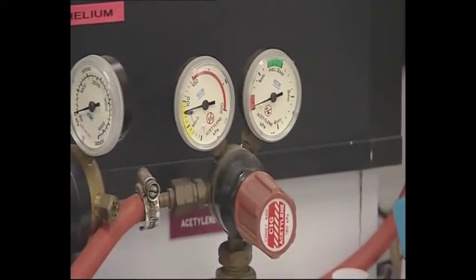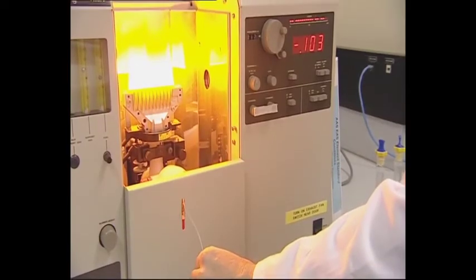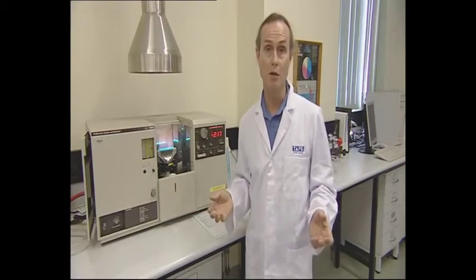A small amount of sample is sprayed into the burner, which uses either air acetylene or nitrous oxide acetylene to generate a very hot flame of between 2100 and 2800 degrees. This releases the metal atoms from their chemical compounds and turns the sample into a vapour.